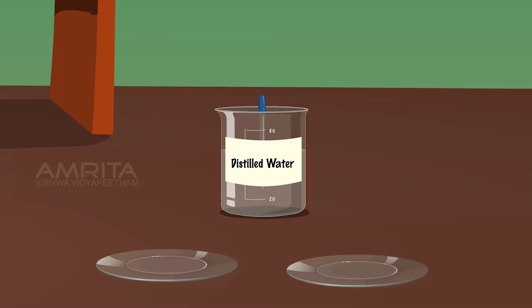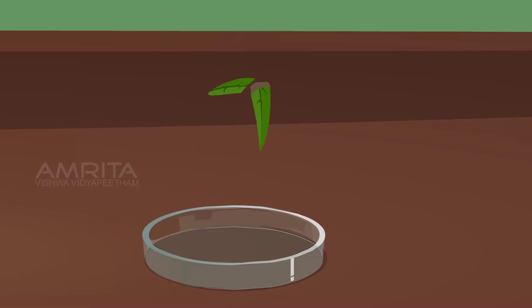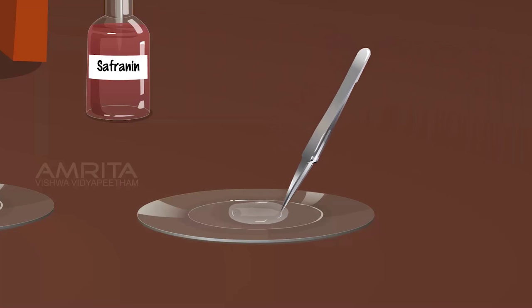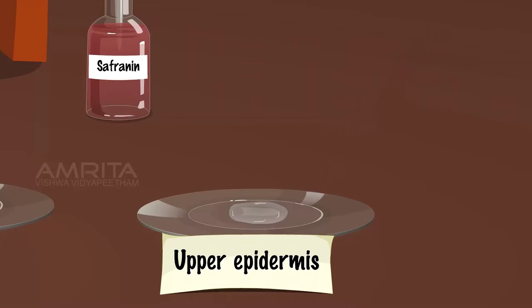Procedure: Using a dropper, take some distilled water and pour it into two watch glasses. Take one fresh leaf of lily plant from the petri dish. Fold the leaf and tear along the upper side of the leaf. Using forceps, pull out a thin transparent layer from the upper epidermis of the lily leaf. Put the epidermis in the watch glass containing distilled water.